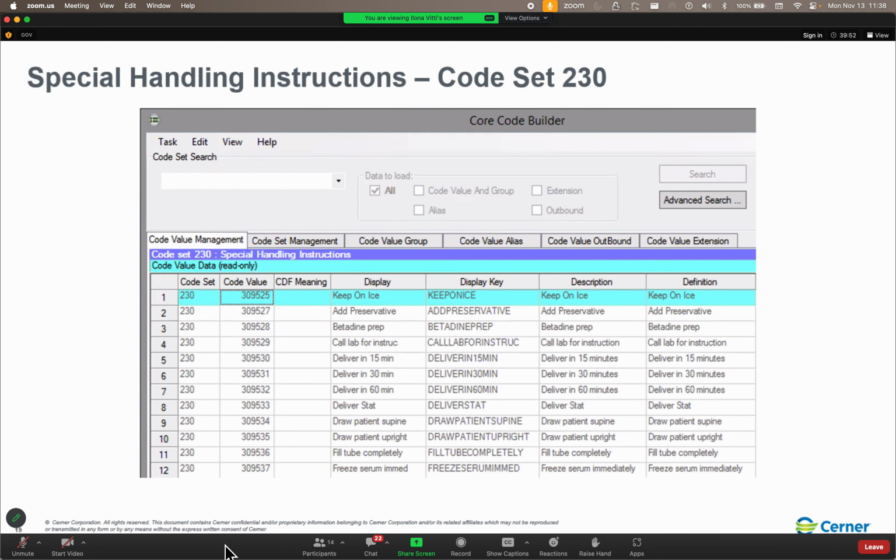So immediate print always. Remember, whenever we're talking about printing, what we are referring to is generating the accession number. So is this collection priority always going to immediately get its accession number? The answer is yes. We check the box for immediate print always. So in this case, that's our stat. Now, before first and after last, we'll actually get to those tomorrow when we talk about our scheduled collections. So I'm going to hold off on explaining those.